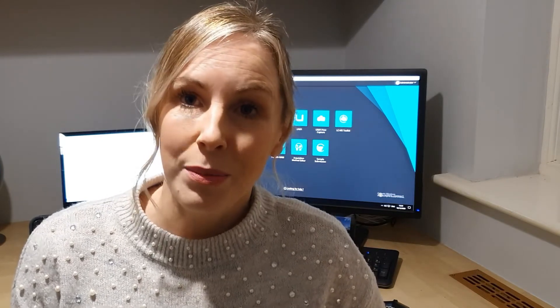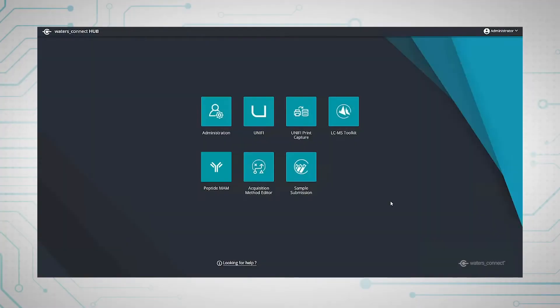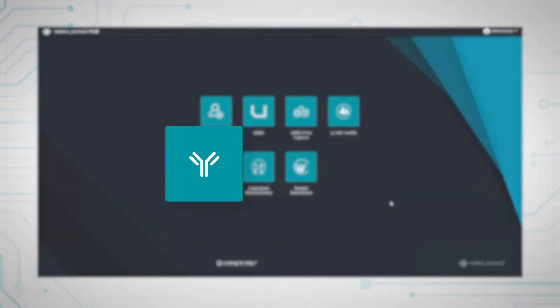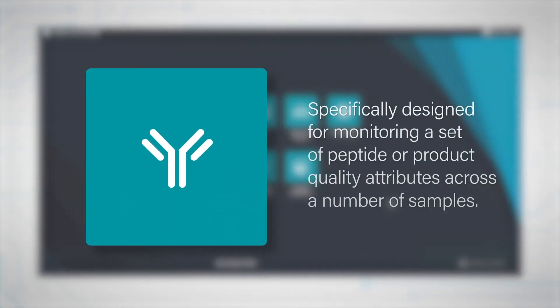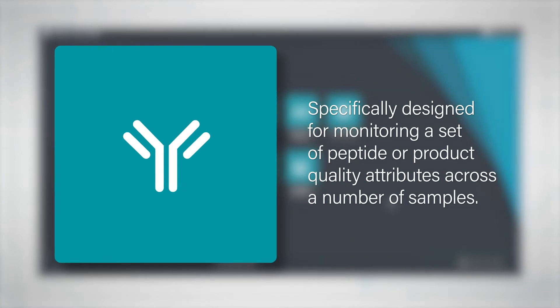In this video I'm going to give you a quick overview of the Peptide MAM app. This app has been specifically designed for monitoring a set of peptide or product quality attributes across a number of samples.